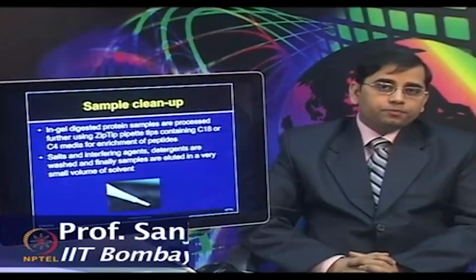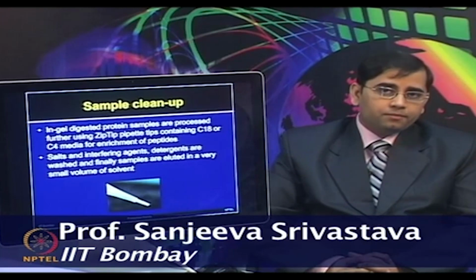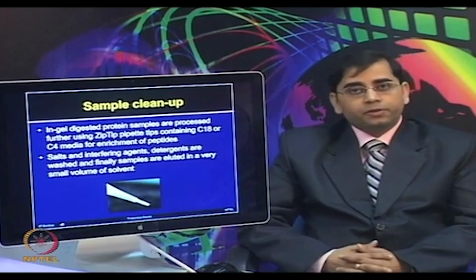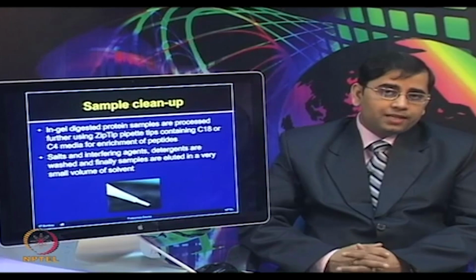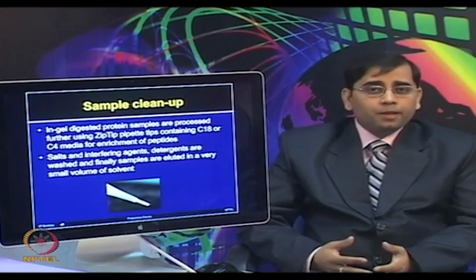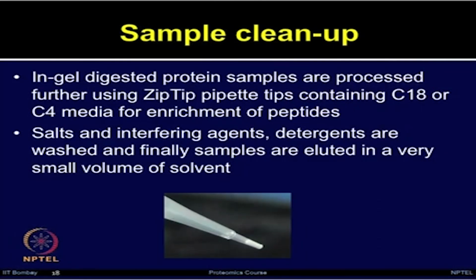After watching this video, now you are very clear about the in-gel digestion process and how various steps are important to perform these experiments. Once you have done the in-gel digestion, you can directly use these tryptic digests for further mass spectrometry analysis, but it is often recommended that in between you add one more step, which is sample cleanup. You do not want your columns or your MALDI instrument to get clogged due to the salt or some other interfering residues present in the mixture. So, it is recommended that one should use a cleanup step in between.